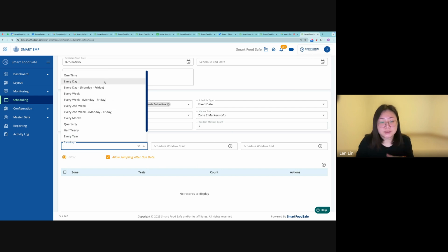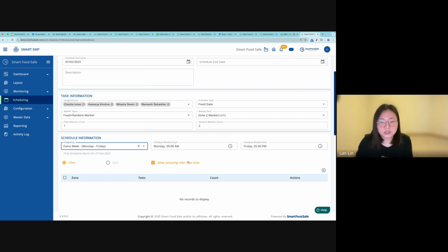Now the frequency. There are many options. You have one time. That's only going to happen one time. Every day, every weekday, every week, every other week, or every other weekday. And every month, quarterly, every year, random, and custom. I'll just give an example of every week and only weekdays.